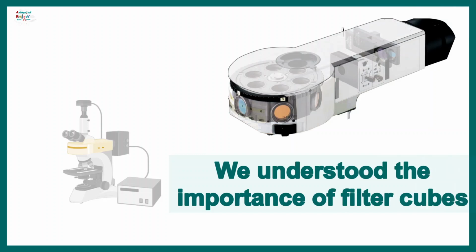So now we understand the key part of this fluorescence microscope is this filter cube, because by changing it, we can change different wavelengths of excitation, right?